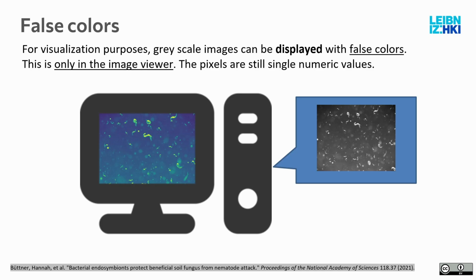So you will encounter them usually in ImageJ and in any image tool, and it's important to know the difference between the real colors or the real values versus the false colors. So you can go into any image tool and say, okay, this is my image, it looks a bit boring. I can tell the tool to make it pretty colorful. This is usually very helpful if you want to present something to media. They love it when it's colorful.